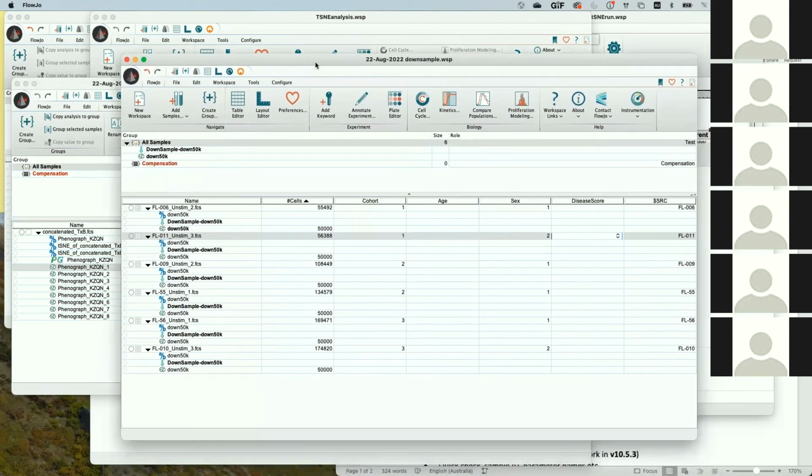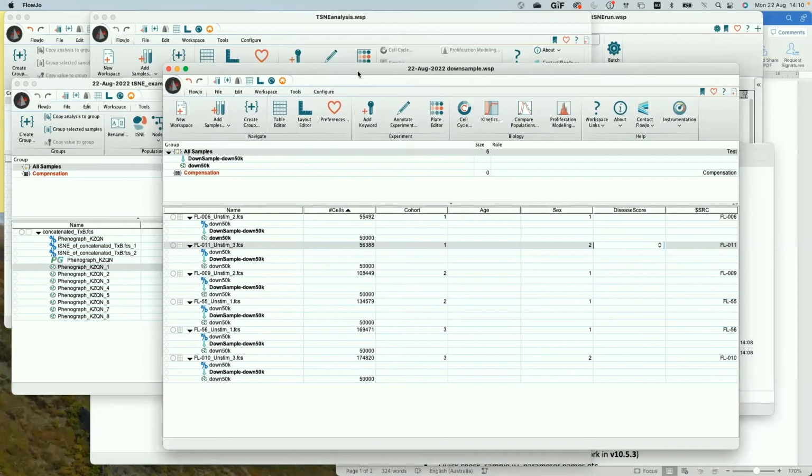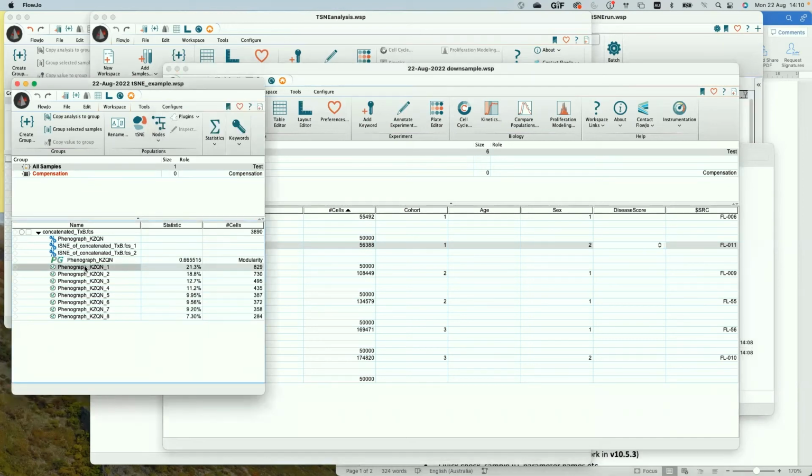I don't know if there is still some time, but I would like to ask you if it's possible to repeat the step from the analysis with the phenograph to the moment you have the different cohorts in 3 different plots. I didn't really catch that.